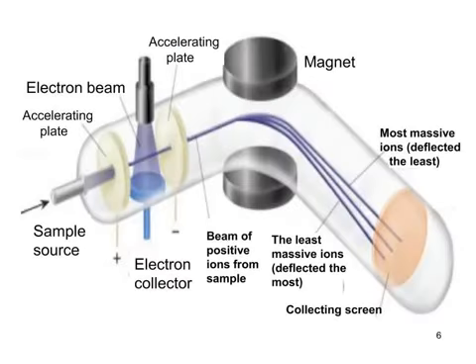And here's a third and final image from a different source. And it's referring to acceleration plates. Again, the idea that we create in here the M+ ion. And if we make this particular plate positive and this particular plate negative, we're going to get repulsion from the positive plate, and that's going to cause them streaming here. I also like the idea of the small slit in this accelerating plate, the negative plate, where it will focus the beam to produce a narrow beam, which you see here.